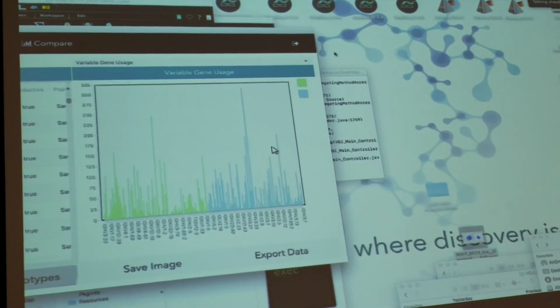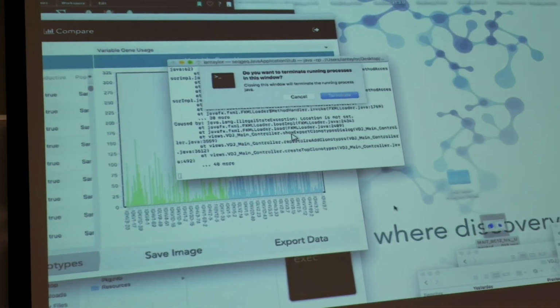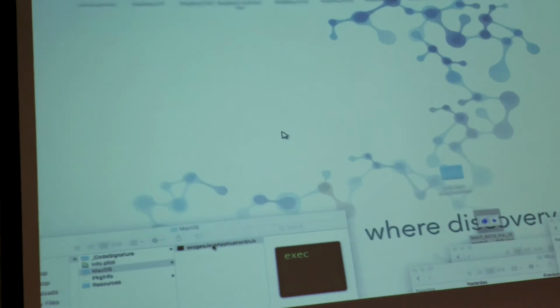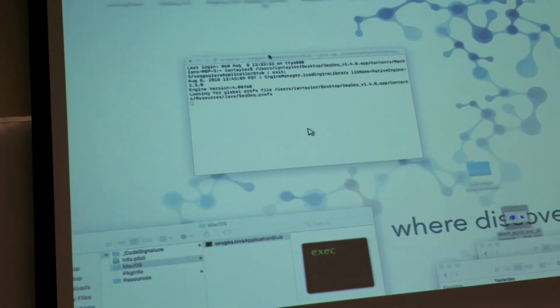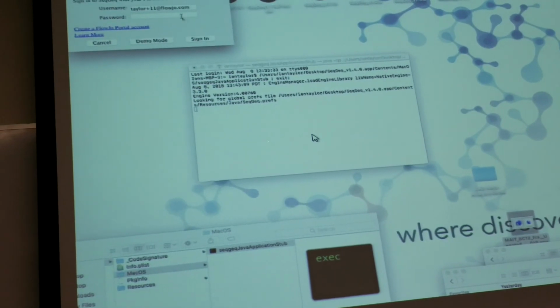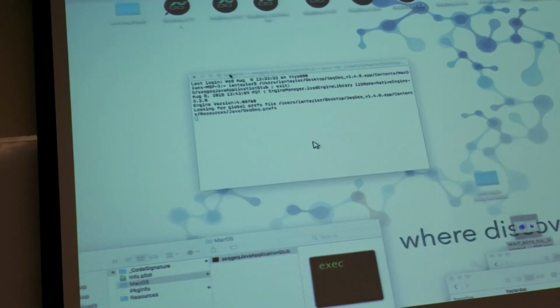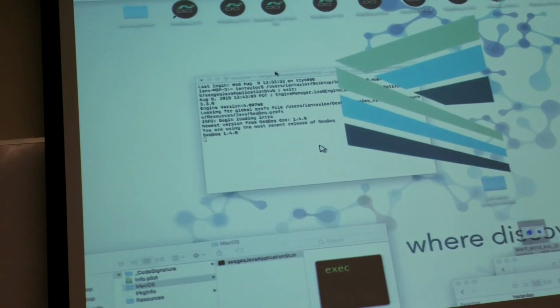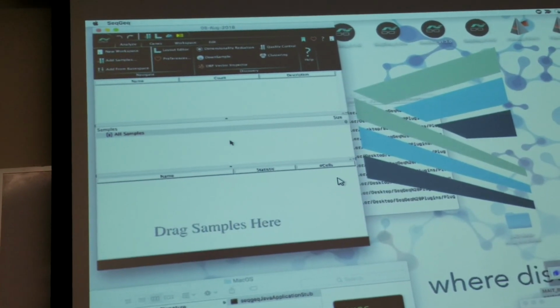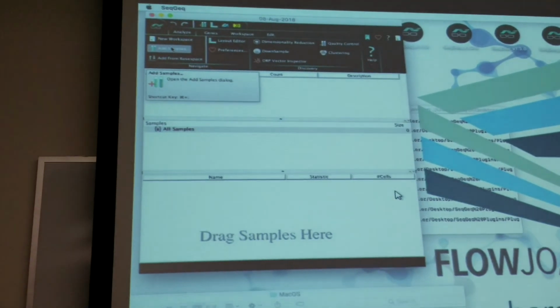Quick question, Ian. Even if you're just looking at the summary of all of them, in the first page, when it's showing the counts for some of the clonotypes, I think the highest clonotype had just 3 counts in it, while some have 2, 2, 2, but the majority of the defined clonotypes only have 1 member.